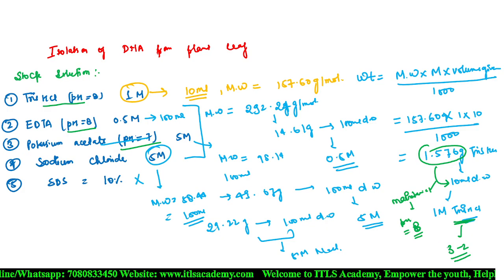It is acidic, and you have to maintain it till it reaches pH 8.